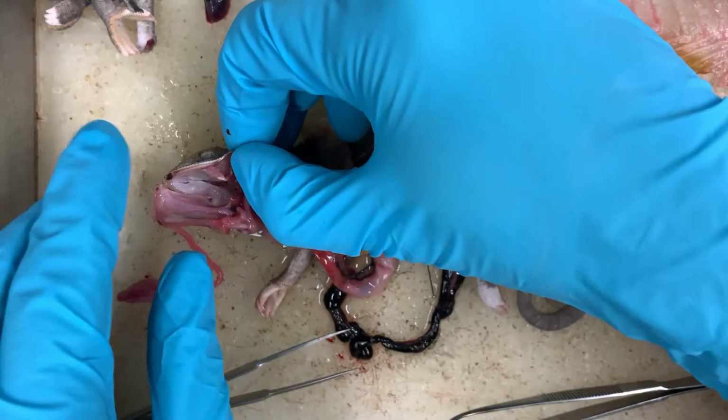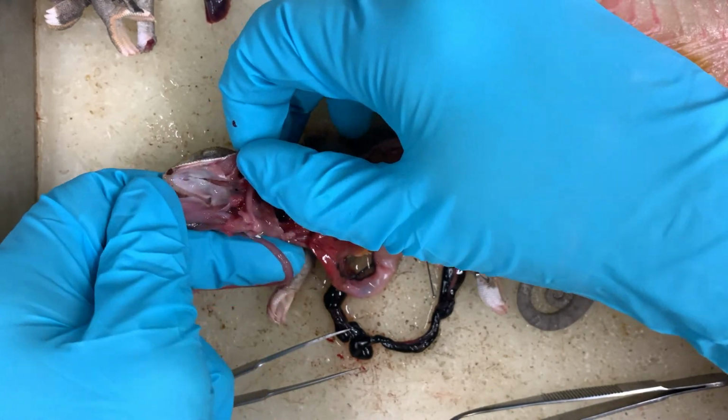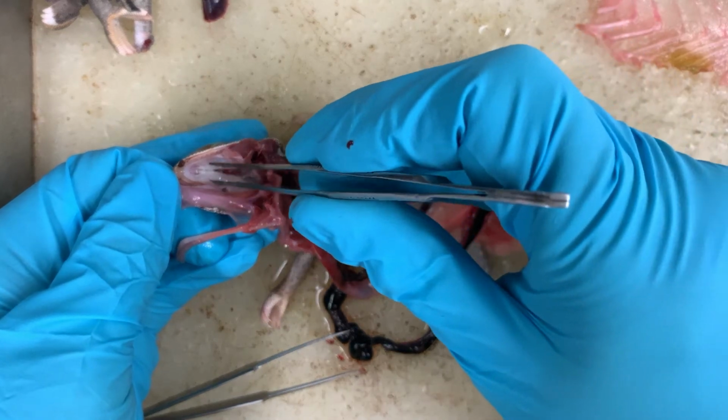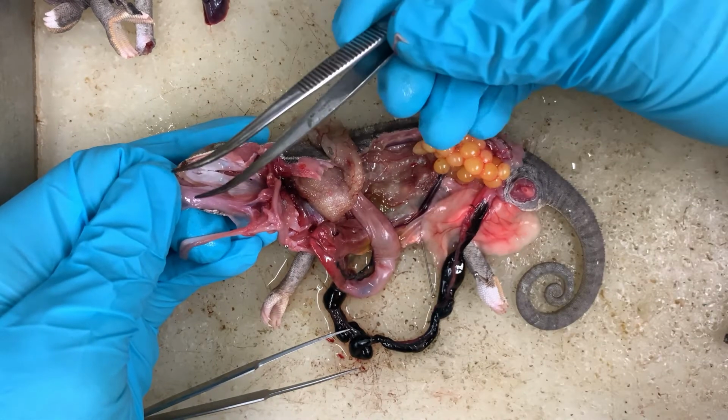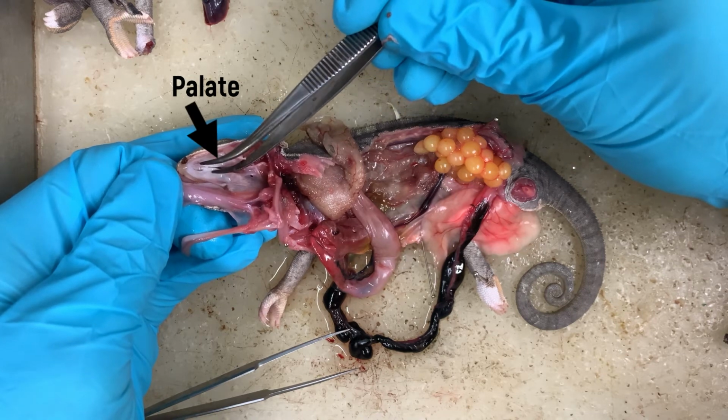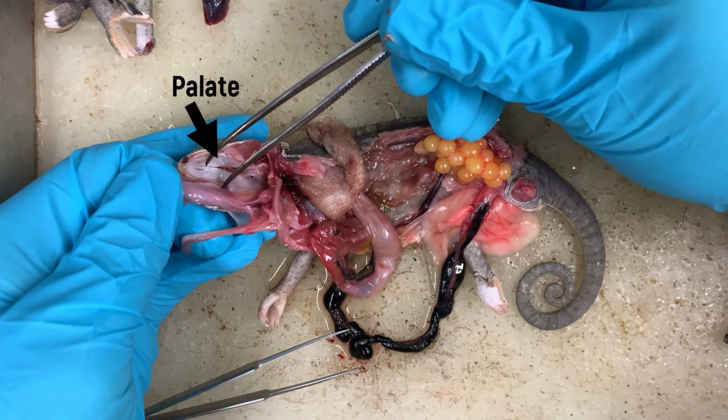With the lower jaw removed, we can also examine the palate of the chameleon. Here we can see the palatine and vomer bones, which form the roof of the mouth. The anterior slits are the openings of the vomeronasal organ, and the posterior cleft is the fleshy palate.